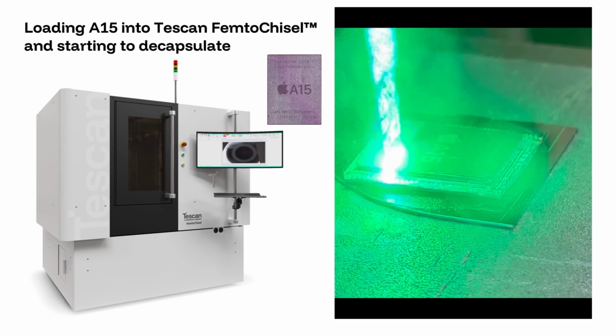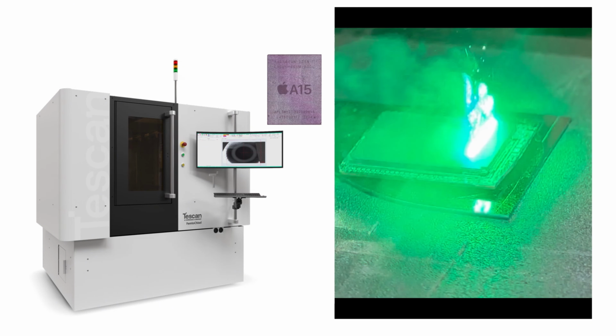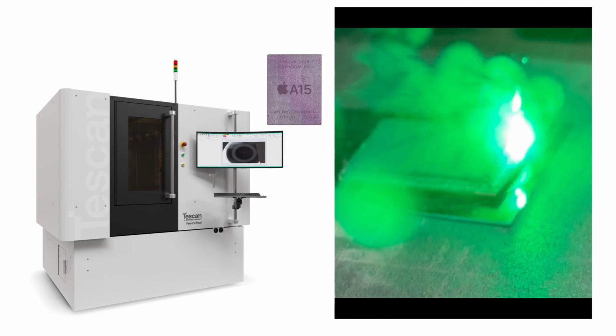The isolated package is then transferred to the Tescan FemtoChisel. From this point forward, we begin controlled laser processing. The first objective is decapsulation, removing the encapsulating material while exposing the package-level structures underneath.